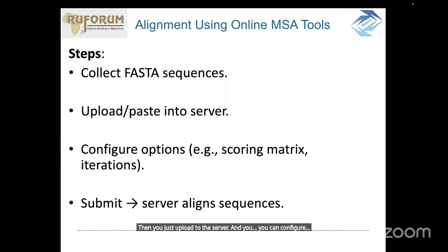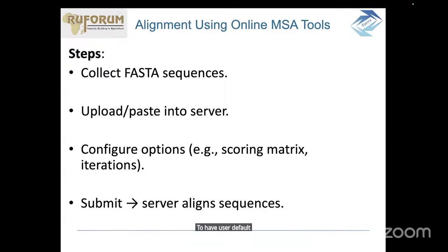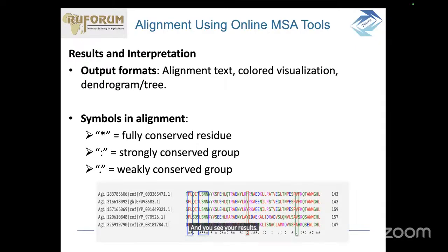And you can configure, which means you can play with the parameters, but I always advise to use the default. Then you submit to the server, and after that it will come back and you see your results. Okay, so that is the online tool we're going to use.